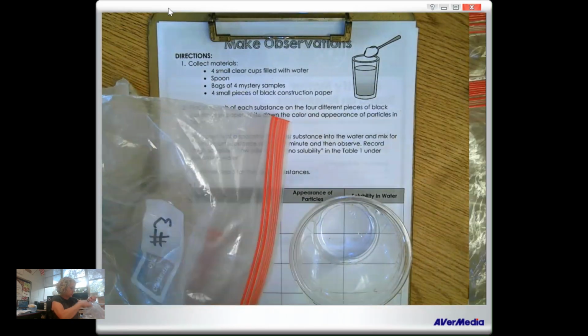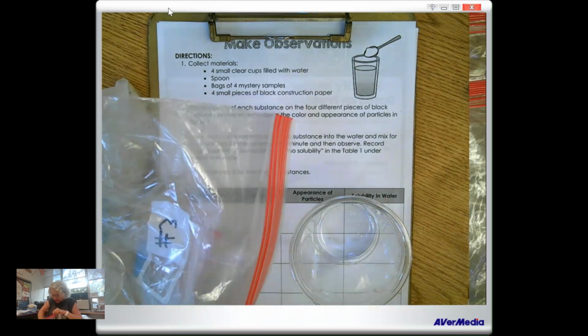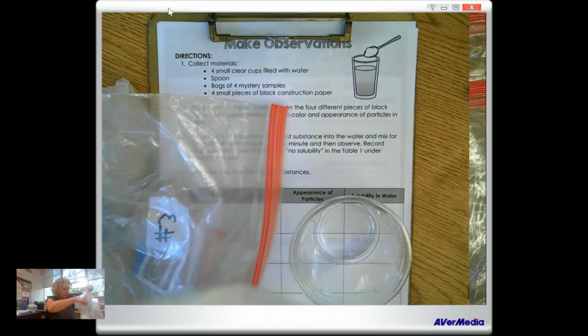Sorry, I'm so slow. Oh, where'd my spoon go? Darn it. I've already started this video about 4 times, so I'm just going to roll with it, okay? We're just going to keep on through the mistakes.